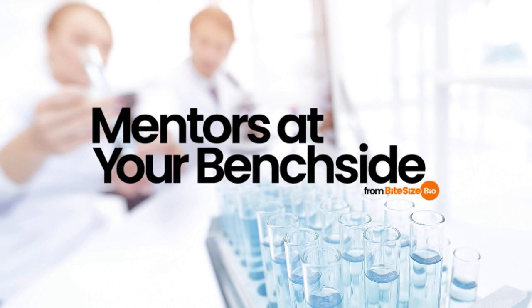Tip number 6, detect shifts over time. Some systems are prone to drift over time. For instance, background absorption in high-performance liquid chromatography may be indicative of column failure. If you notice that measurements drift in a single direction over weeks or months, address the issue immediately by recalibration or preventative maintenance. Tip number 7, consider the human factor.